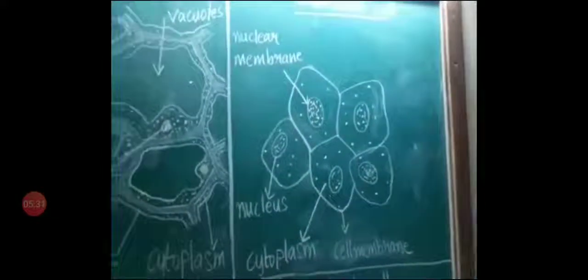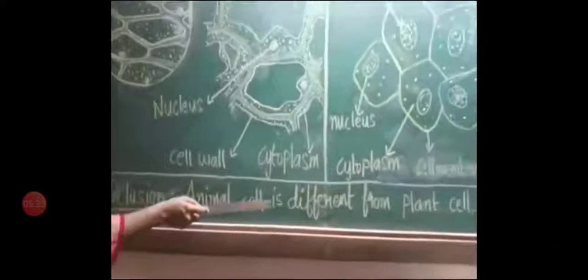So after this experiment, what you have learned is that animal cell is different from plant cell.